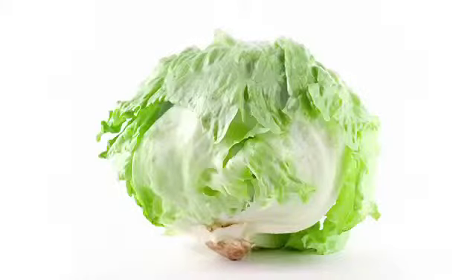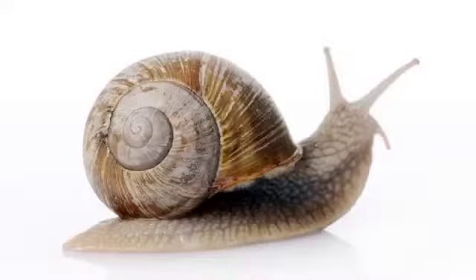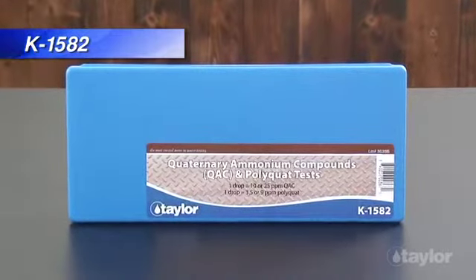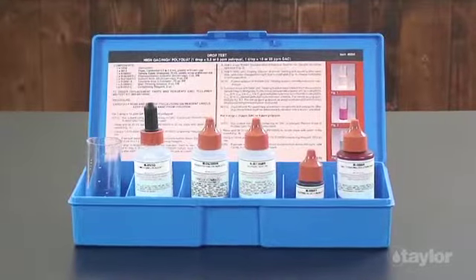In the food and beverage industry, QACs are also used for sanitation purposes. Quaternary ammonium compounds are also effective in controlling mollusk populations. With Taylor's K-1582, testing for this analyte is easy, and the kit comes with everything you will need.